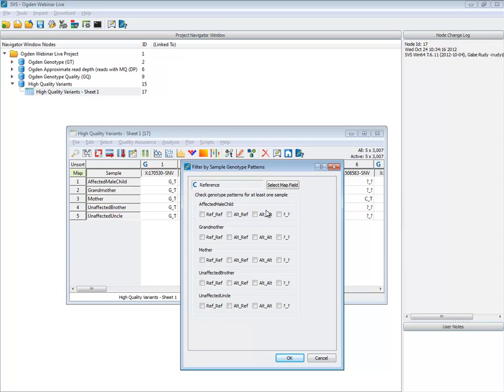Again, our affected male, we expect to be homozygous alternate, because we're not distinguishing between hemizygous and homozygous. Mothers and grandmother, we expect to be carriers, to have that in a heterozygous state. And the brother and uncle, because they are controls, they should be reference. But remember, we filled our holes in with missings, so missing also represents reference here.